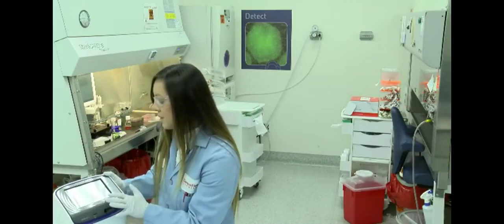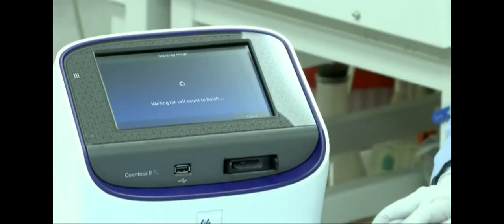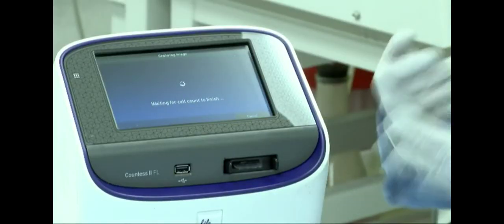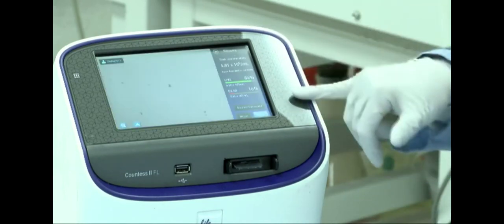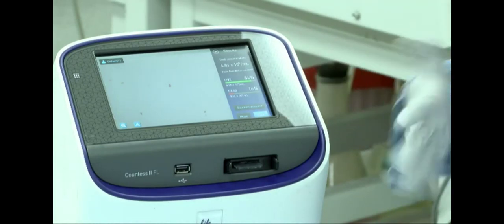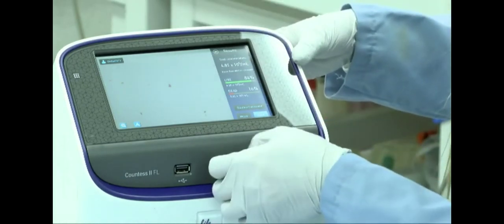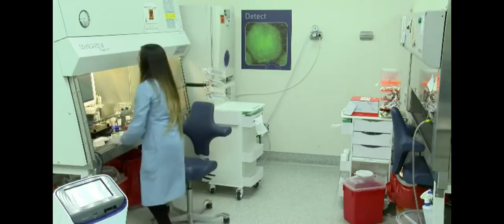So right here, it looks like it's focused. You press capture, and it's automatically going to count based off of the Trypan Blue. So it's going to give us a total count and then a live count and a dead count, which you can see right here. So it's about 84% live, 16% dead. So not too bad. So once we do that and we get our live cell count, we can go over here and then plate our neurons.